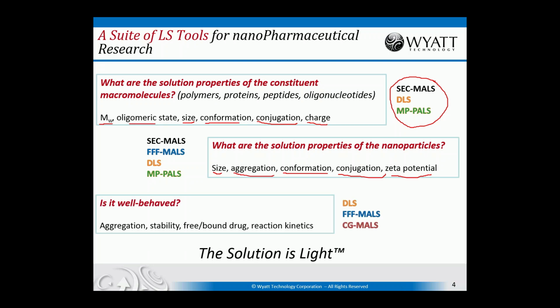And then finally, once we have a product, we'd like to know if it's well behaved. So does our product aggregate or is it stable? If we are incorporating a drug into a nanoparticle, is it in fact incorporated or is it free in solution? And finally, reaction kinetics, for instance. How does the carrier vehicle degrade when it reaches the physiological environment, or how is it formed? And so light scattering will answer all of these questions for us with a coherent and extensive set of experimental techniques.